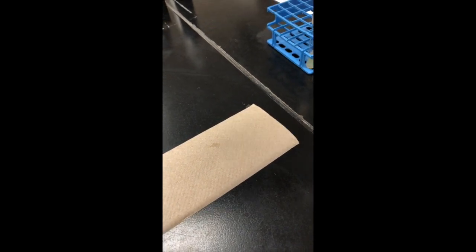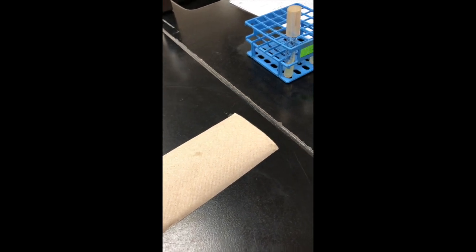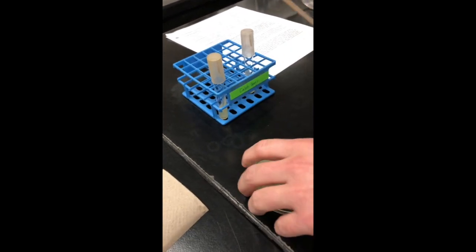Put this in the bleach beaker for me. Thanks, Andrew. Our cotton swabs go in the bleach beaker when we're done, and Andrew has nicely helped Ethan get his cotton swab to the bleach beaker. He's a good friend.